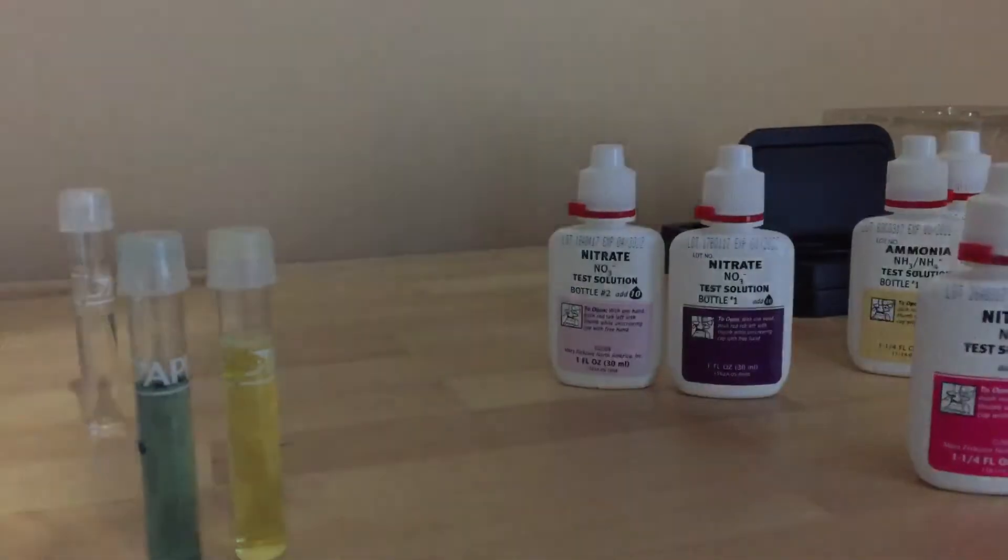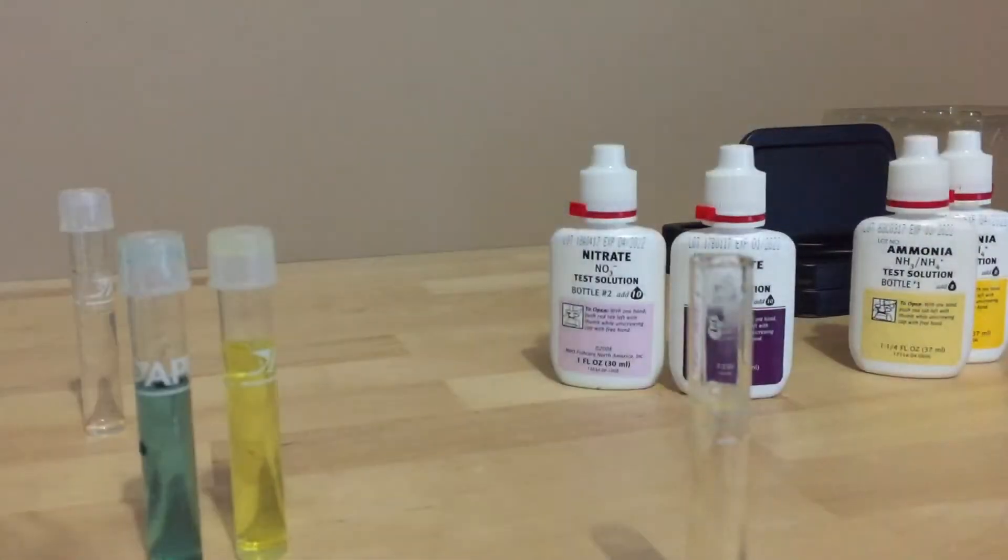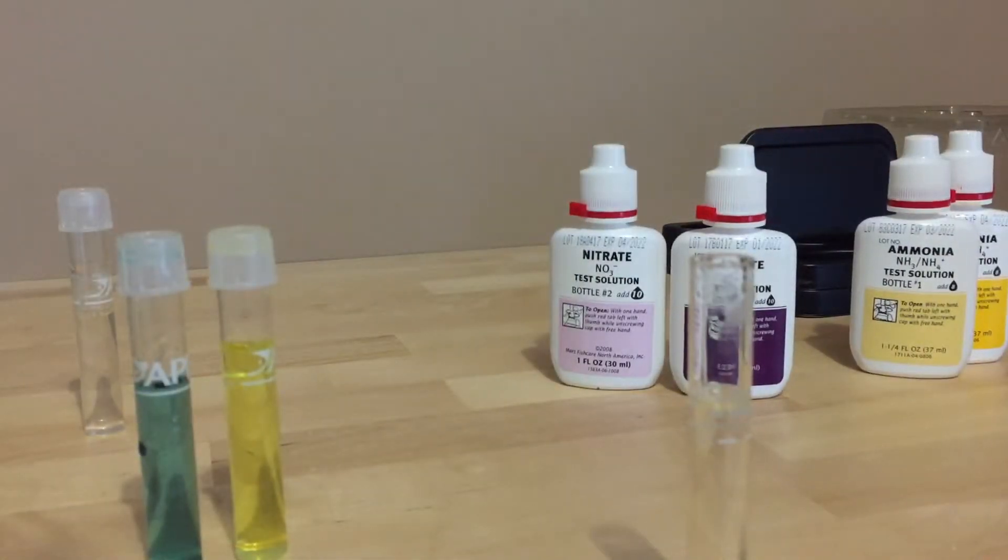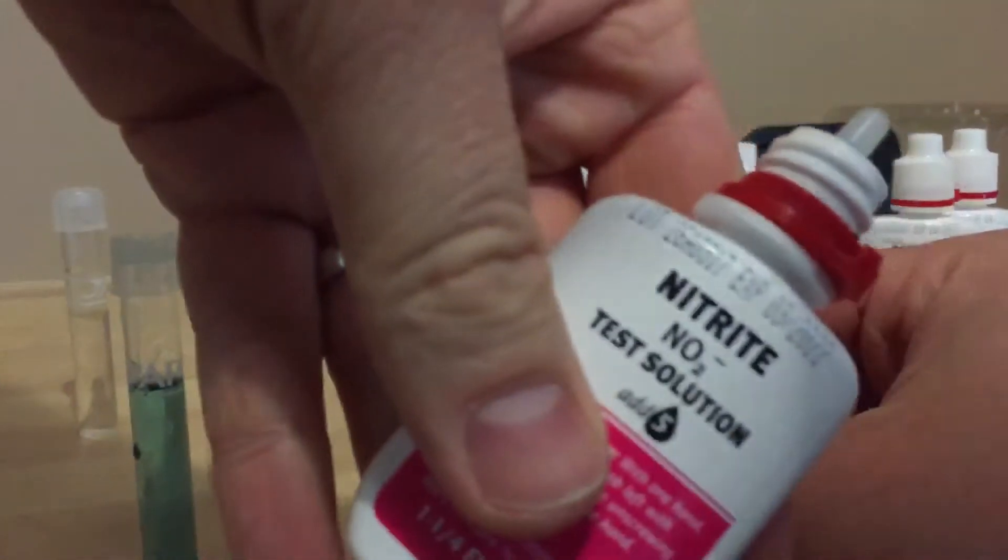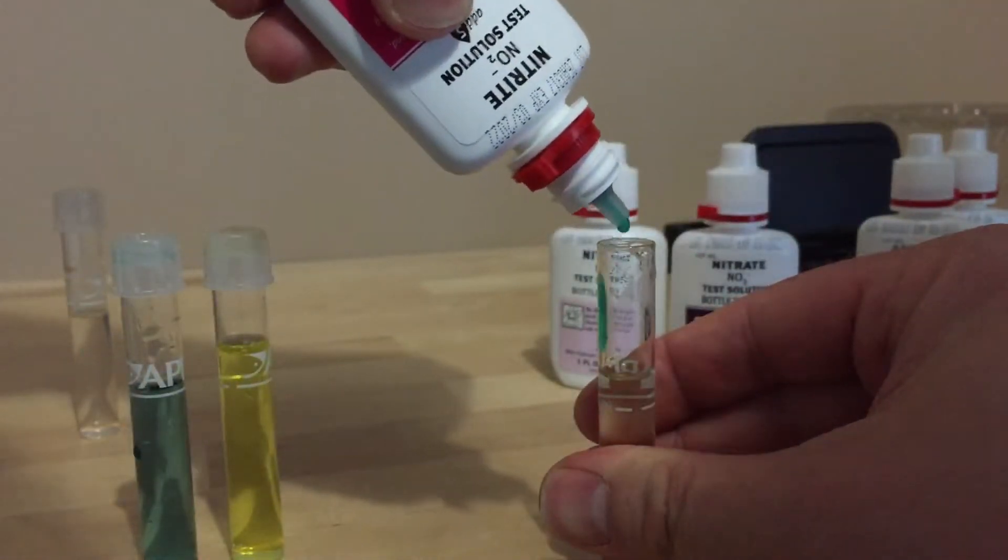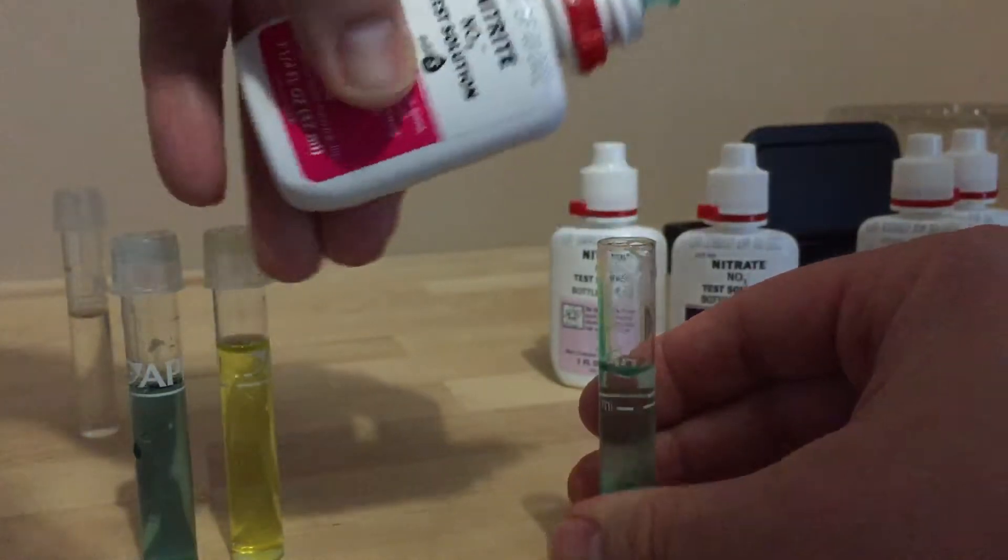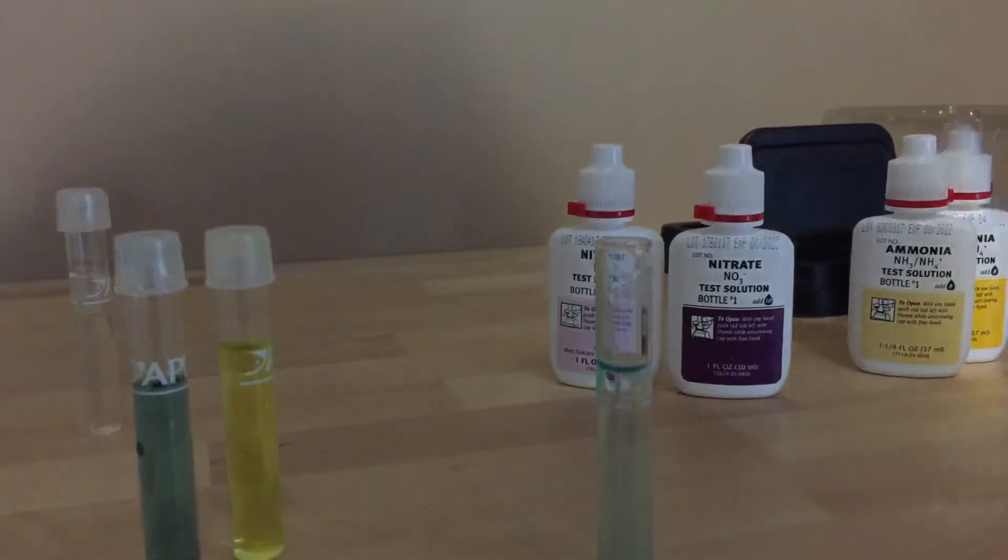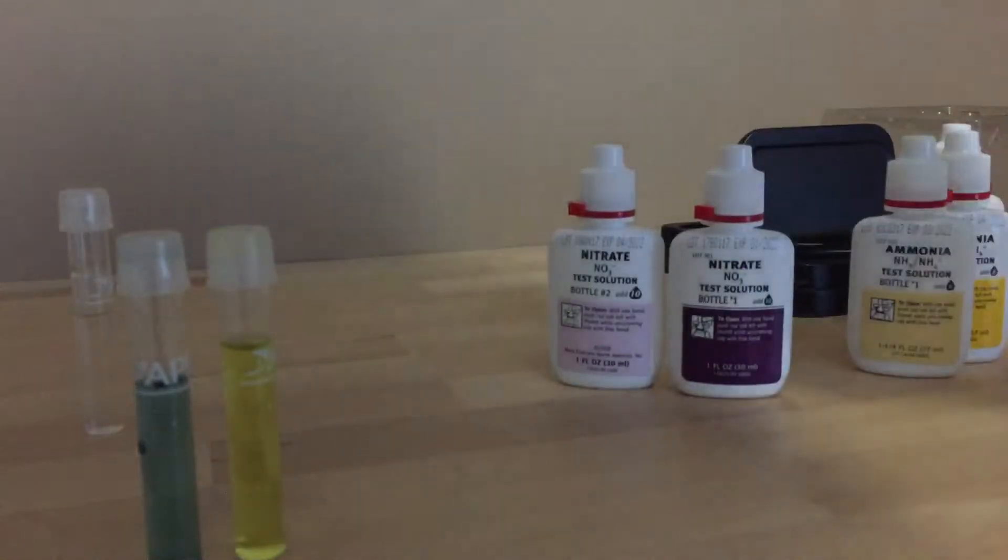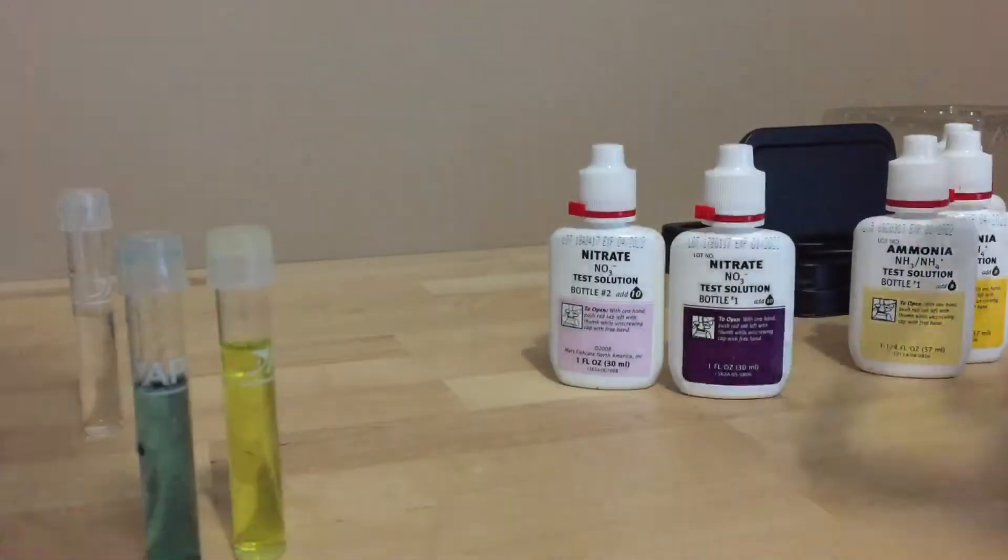And so the next one we'll test for is nitrites. Okay, just shake the bottle and this time you'll see that it says add five. So one, two, three, four, five. And again you just shake this one for five seconds and leave that one.